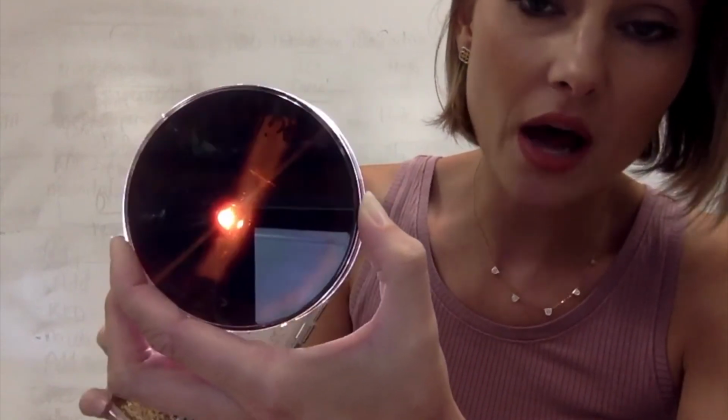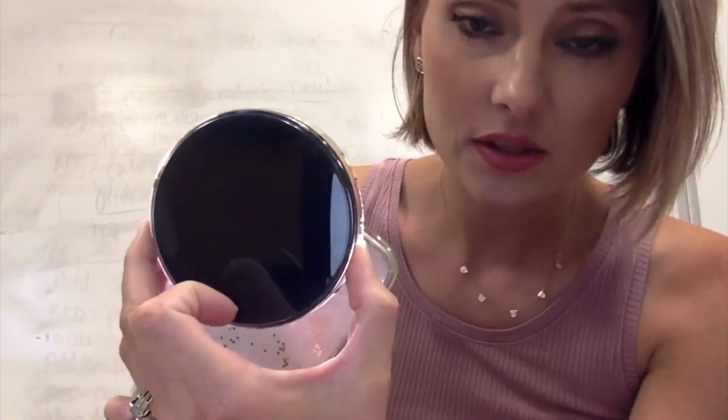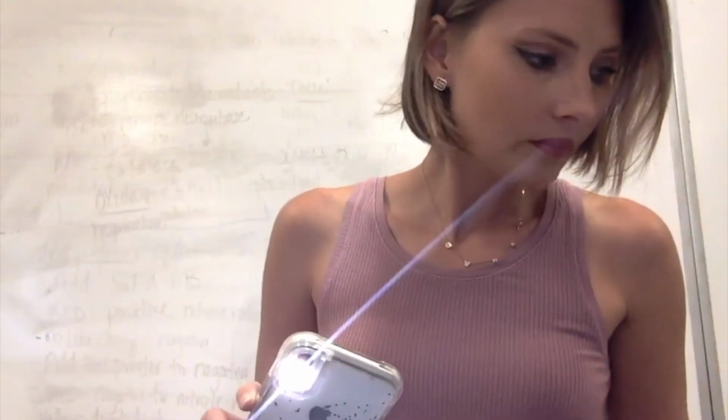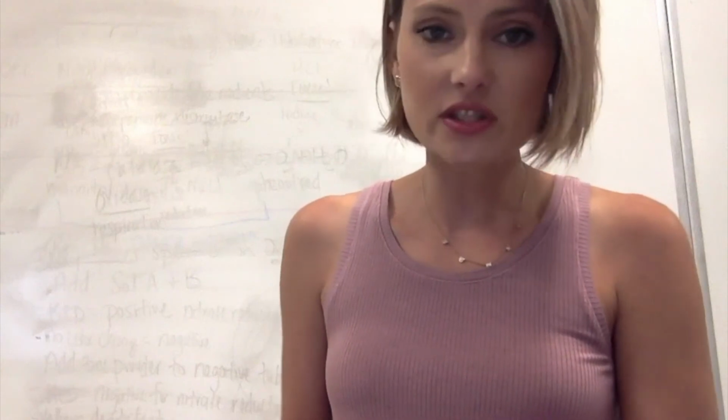So halo, positive for starch hydrolysis, positive for amylase. No halo, you can't even see my flashlight through that. Jet black, negative for starch hydrolysis, and negative for amylase. Okay, everybody, that's it for all of our results for this first set of selective and differential media.